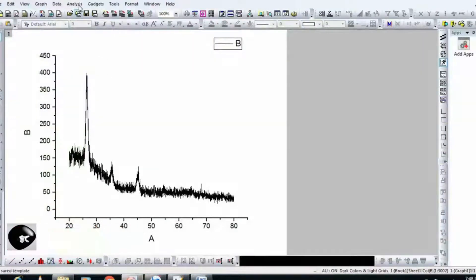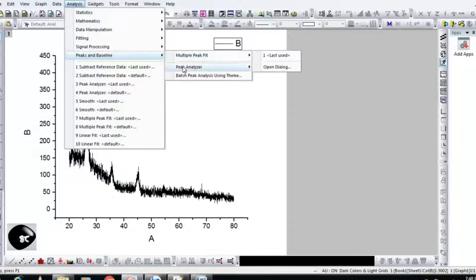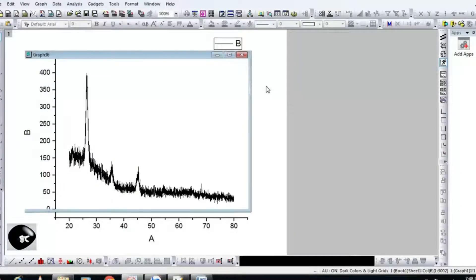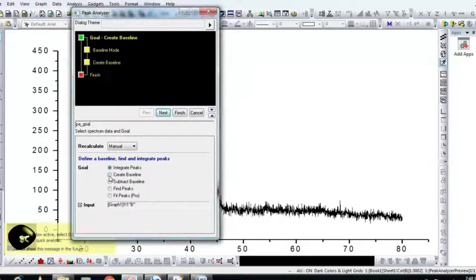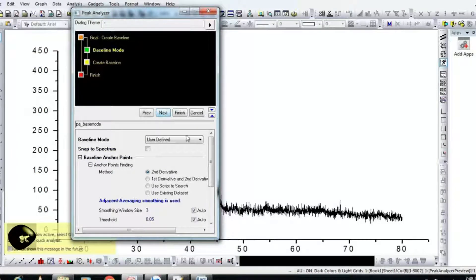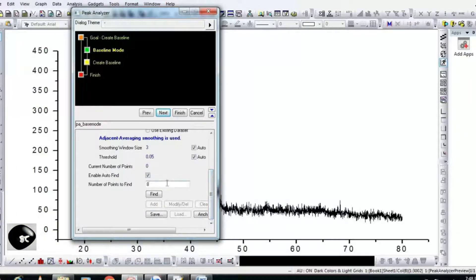Step 1: Go to Analysis, then Peak and Baseline, then Peak Analyzer. In the Peak Analyzer pop-up menu, select 'Create Baseline' and hit Next. Select the number of points according to your data, but it is better to keep it under 20, and hit Next.